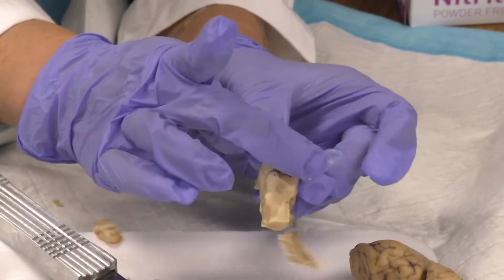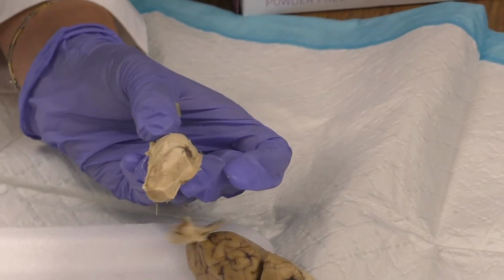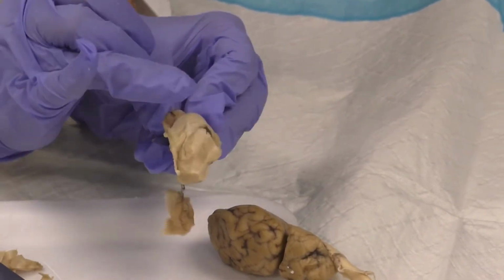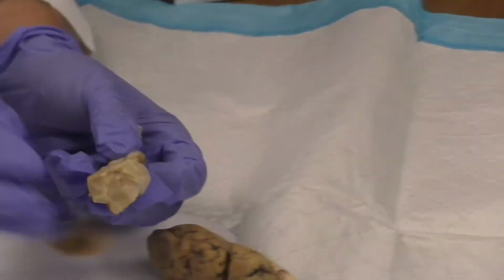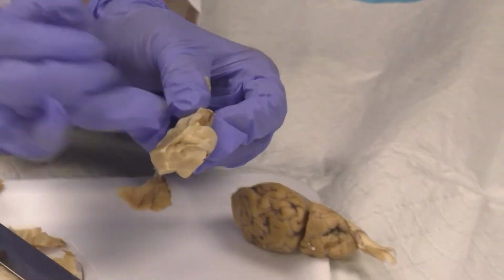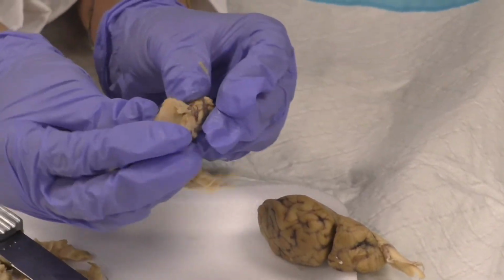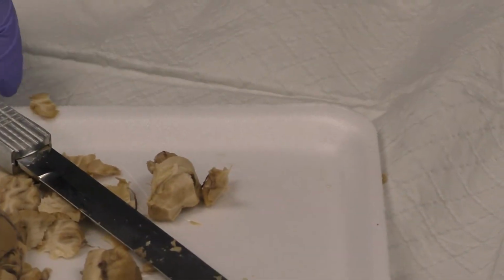There. And also what you can see is the hippocampus is basically spooning the thalamus. There's the thalamus. So the top of it doesn't exactly spoon the thalamus, it kind of goes out to the side. But it's sitting right on top of this ball, which is the thalamus. Okay? So why don't you guys try, you can do the other hemisphere. We're going to start cutting from the outside.